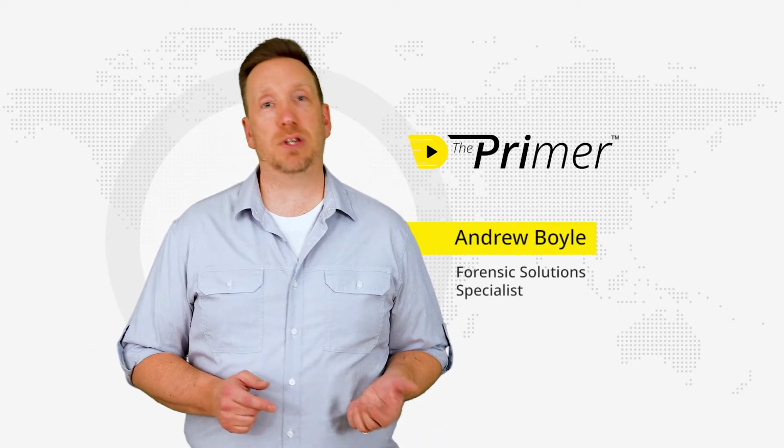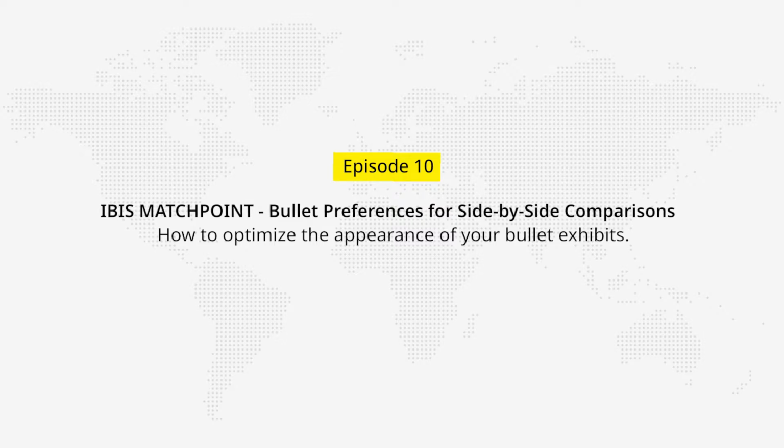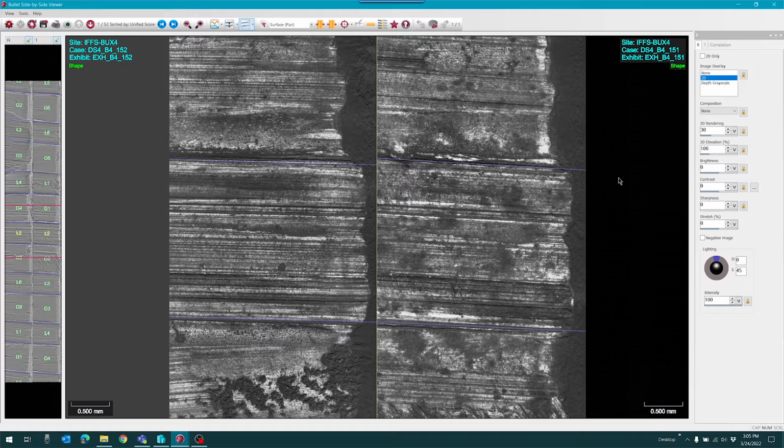This is a video how-to series on the Forensic Technology product line and some tips and tricks on how I think you can best use them to get the most efficient use out of them. In today's video, I want to showcase what sort of preferences I would choose with the imaging tools that are on the right-hand side of the screen here.